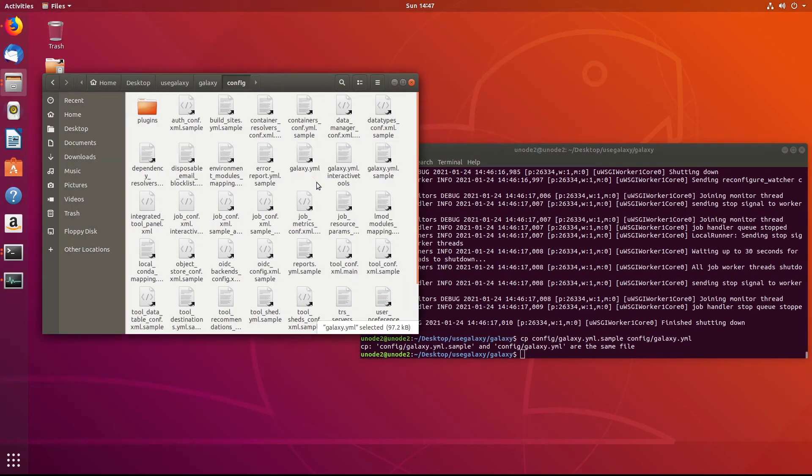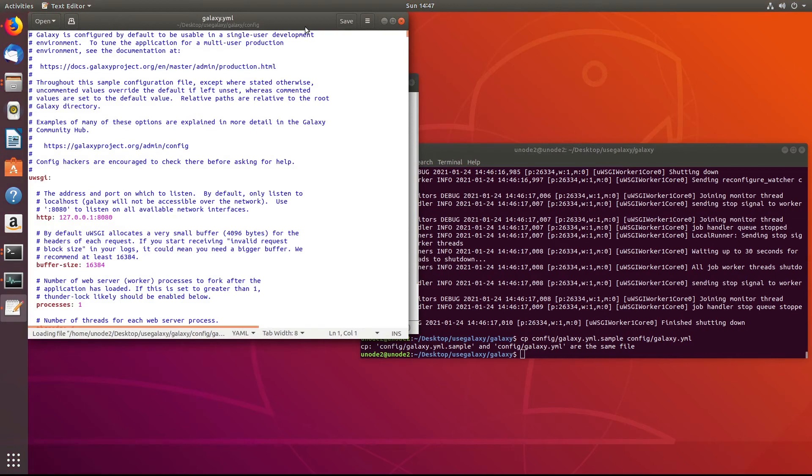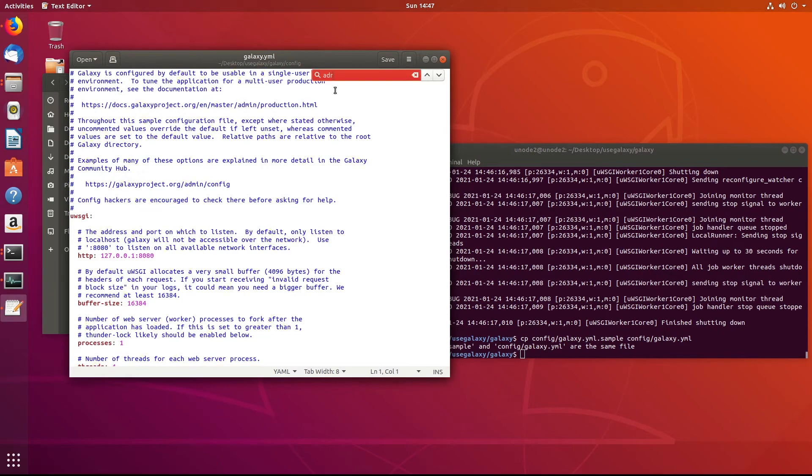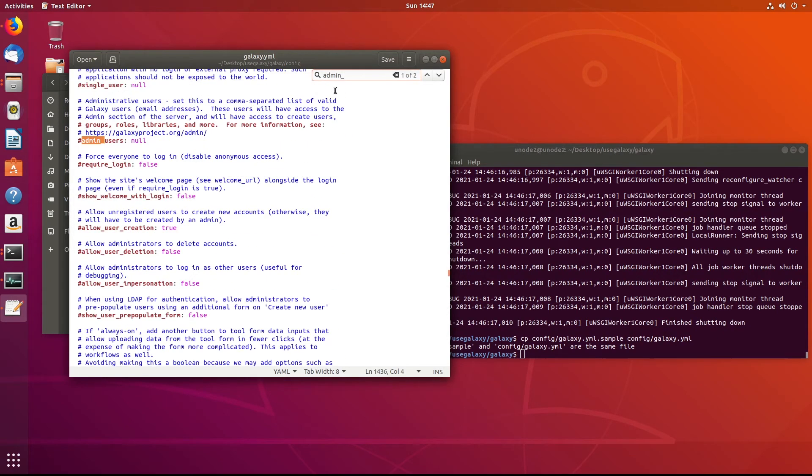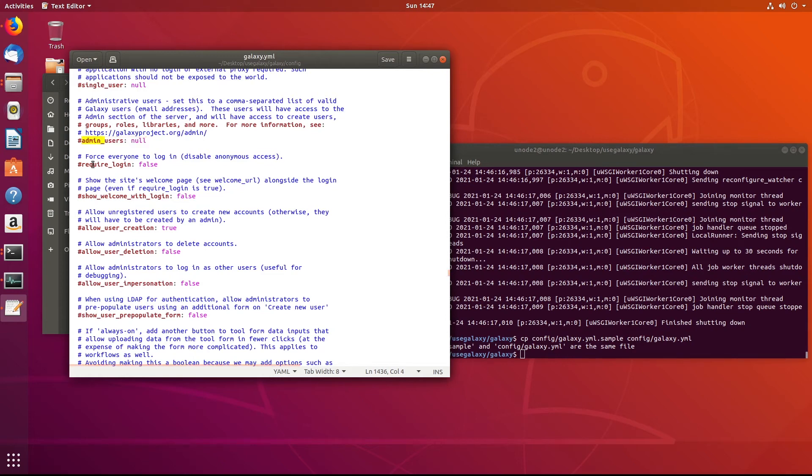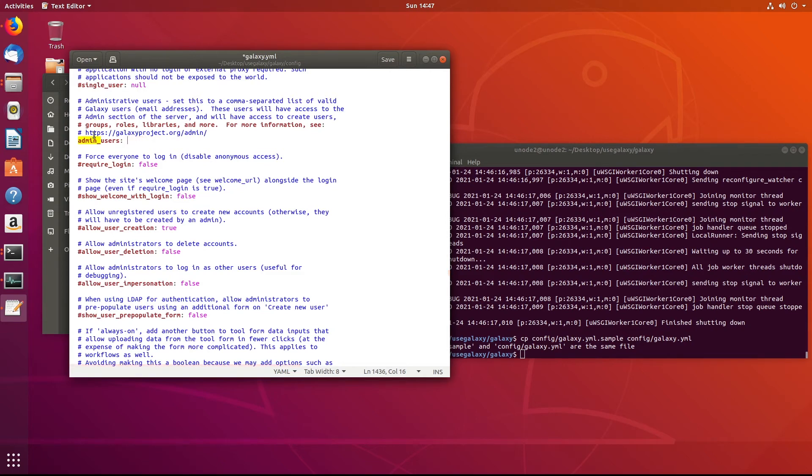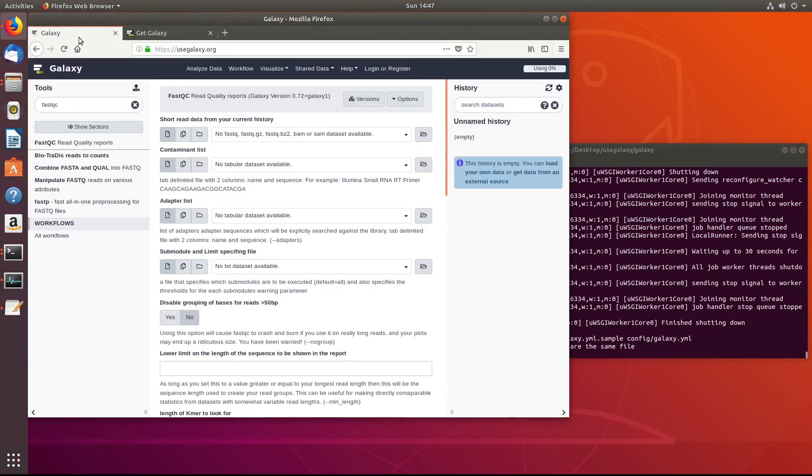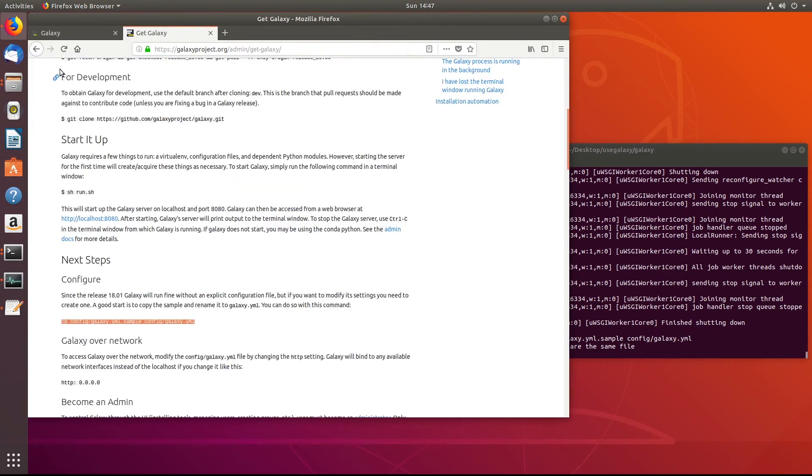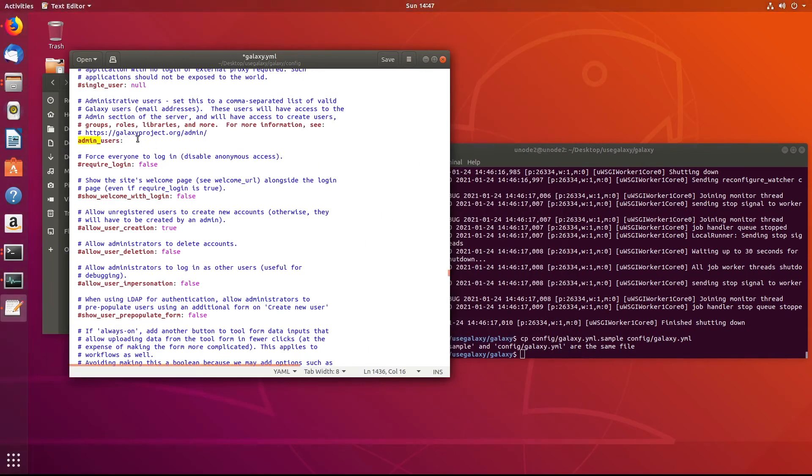What we want to do now is go into this Galaxy.yml. And we need to do control F and then search for admin, admin_users. So this line right here. And what this line is going to do is it's going to allow us to set an administrative user that can go in and install and change a bunch of the settings for UseGalaxy. So we have to uncomment it by removing the hashtag or pound sign. And then here you have to type in a username and password that you had signed up for Galaxy on the usegalaxy.org website. So you go to log in and register and you register. This is going to be the same username or email address that you had signed up with UseGalaxy with. And I'm going to put in mine.